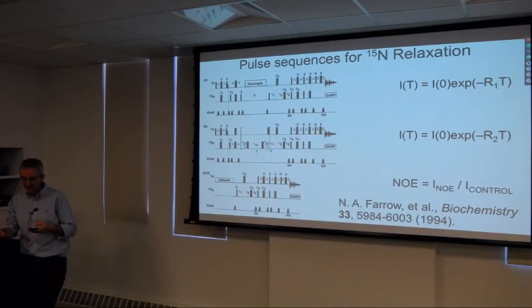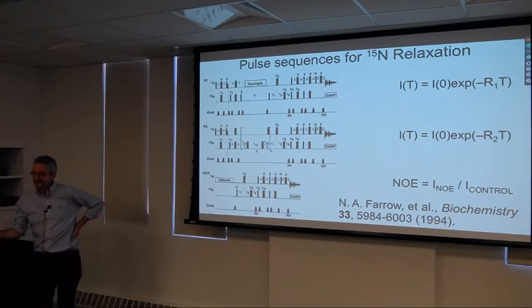So how many T1s do you think you need to wait to get back to Boltzmann equilibrium? 5 T1s?